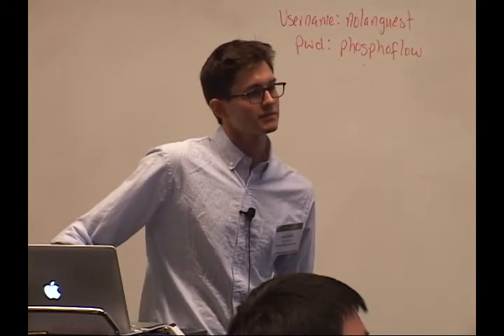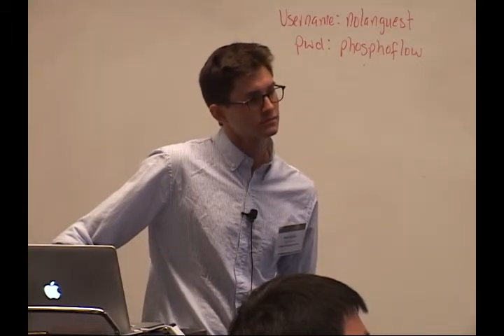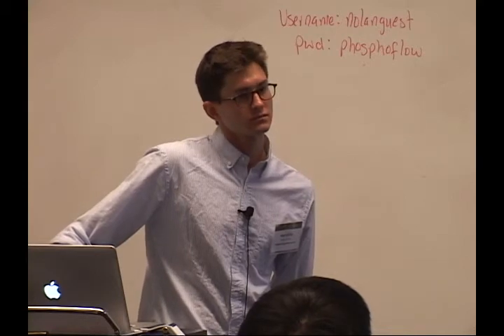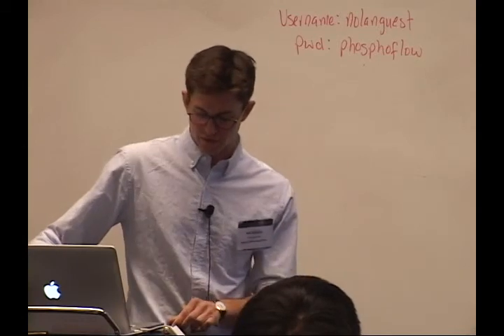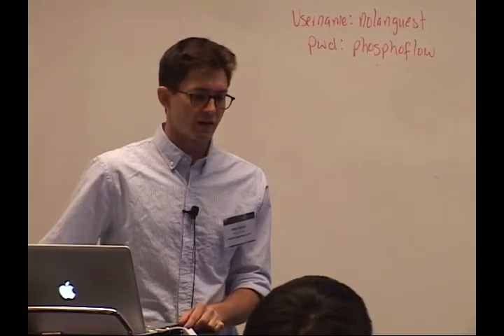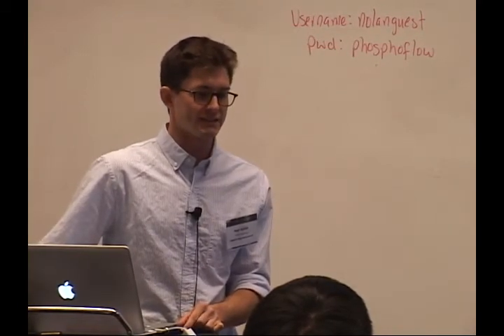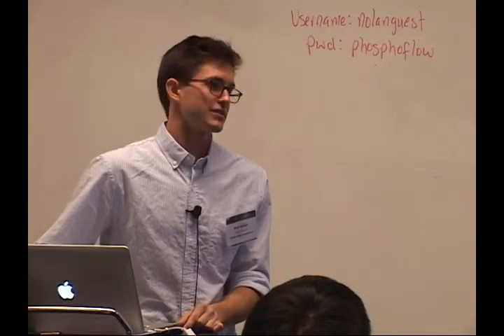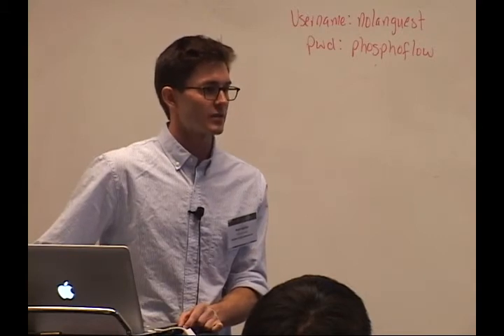Yeah, because then you could take your intensity on the cytometer and potentially work back to the absolute numbers within the cell, correct? Well, in theory, you're coming into the same problem that you have with flow cytometry in terms of the saturation of that process and knowing exactly what proportion of molecules you're staining. The short answer is no. There is no easy way to determine how many metal atoms are on any given antibody.